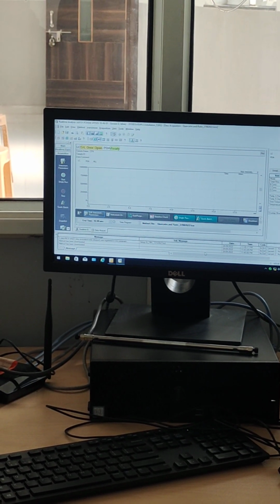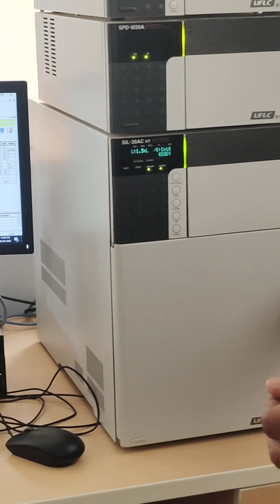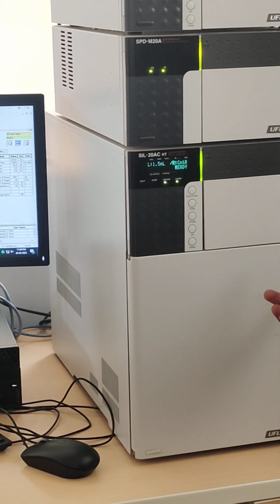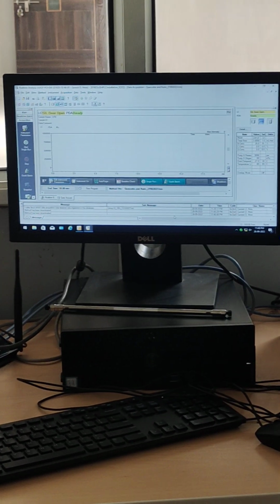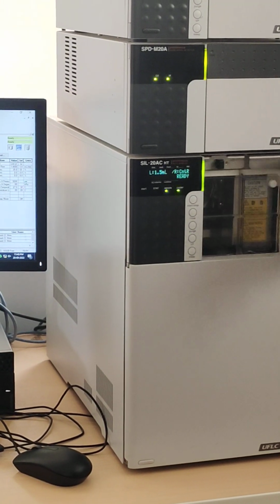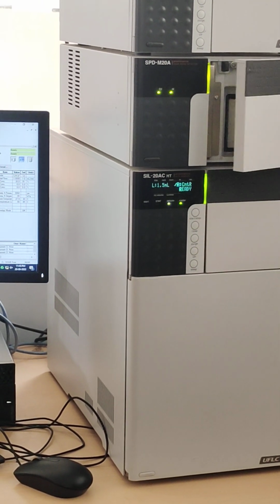Okay. Now we'll close. That door has the magnetism property. What property? Magnetism. If you want to open, it will require some pressure. Just check it. You can check it. Isn't it? So that system is available for this sample door. That system is also there. We have to push. Automatically it will open, and then we will close it. Then push.